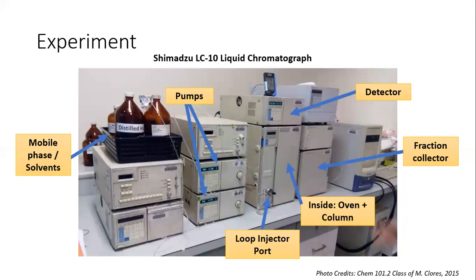So this is the HPLC system at the ASL. So you have here your solvent phase reservoir, mga container ng mga solvents. So usually naka-place sila in amber bottles. Then you have your pumps here. So sa pumps, nangyayari dito yung what we call the purging.